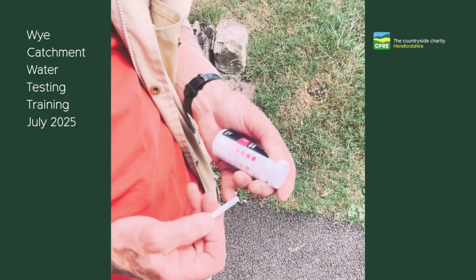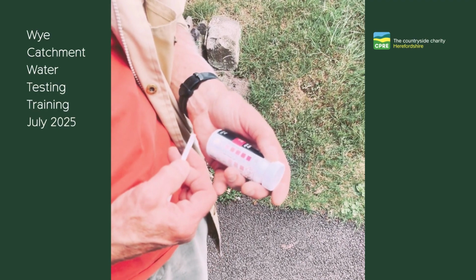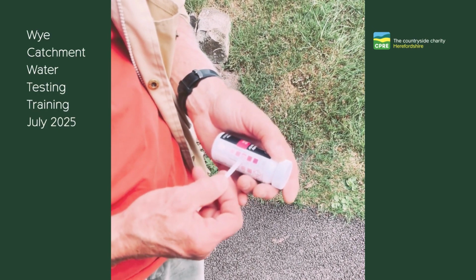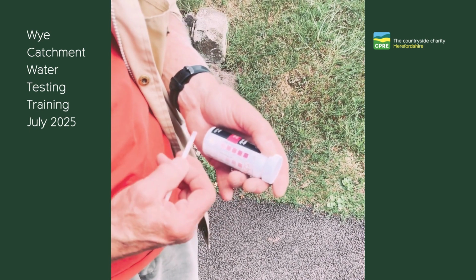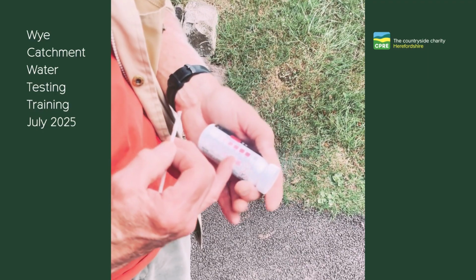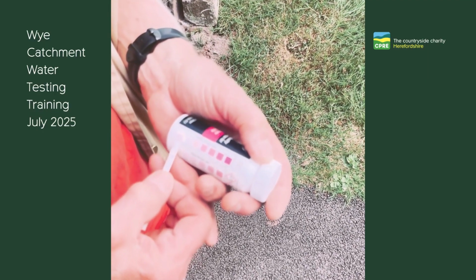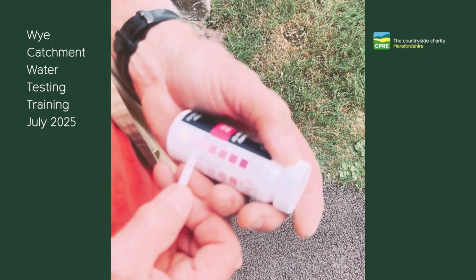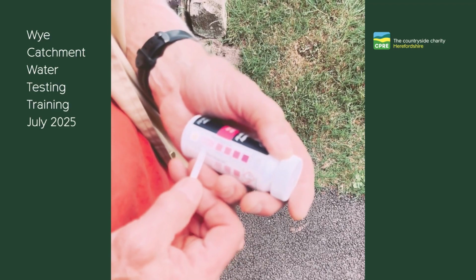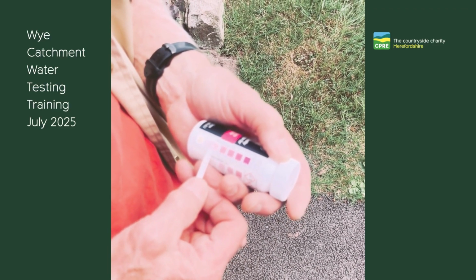But you'll see that that tip has changed in color, and that's simply compared with the nitrate calibration colors on the tube. It's important to ignore the bottom one, which is to do with nitrites. So we run along here till we get a match. It's certainly less than 5, and the closest match would be 2.